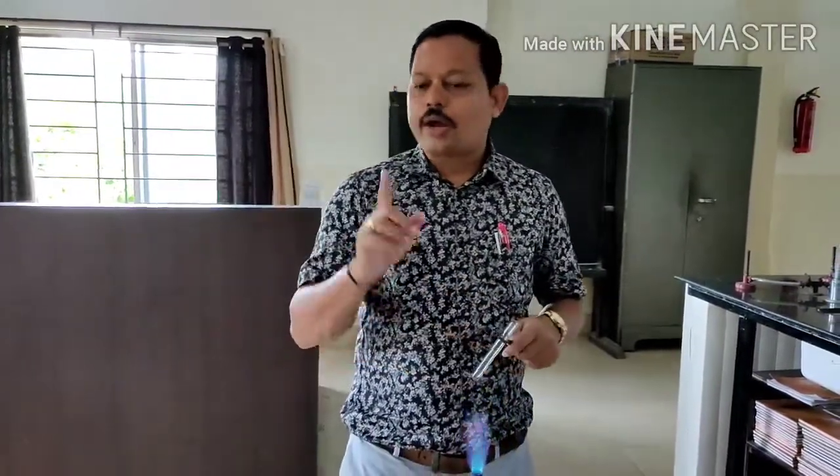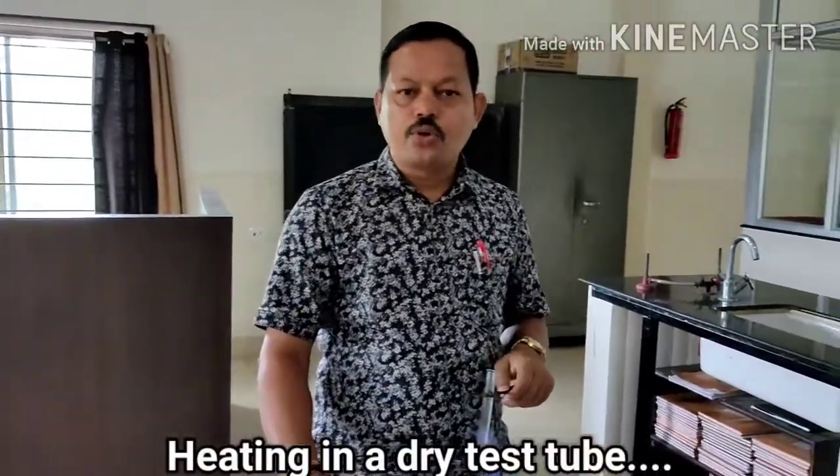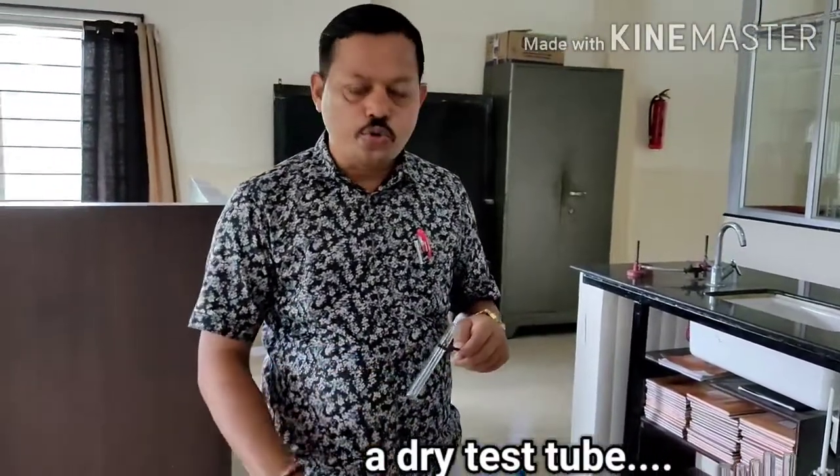Today I will do dry test for cation. Before watching the video, you open your copy, you follow the procedure, then you can understand it. According to your procedure, in dry test of cation, the first experiment is heating in a dry test tube. That experiment I will show you how to do it.